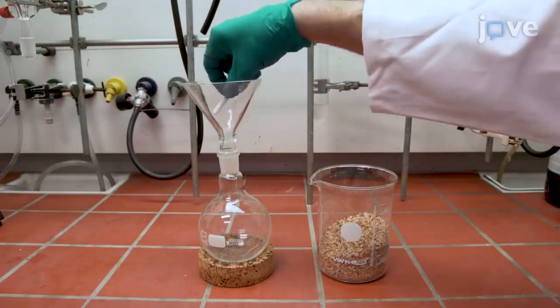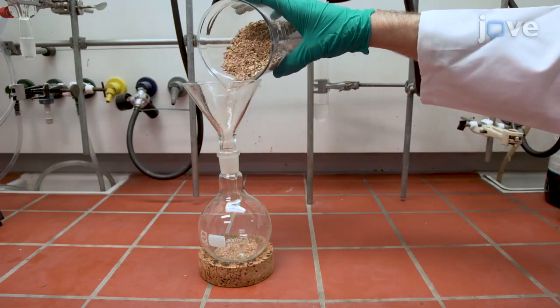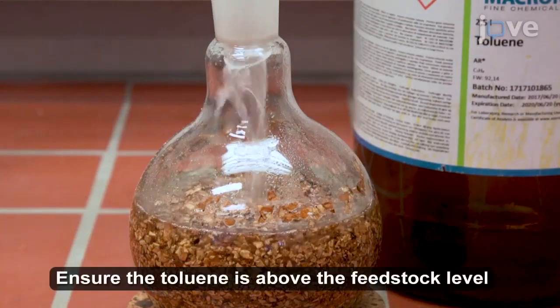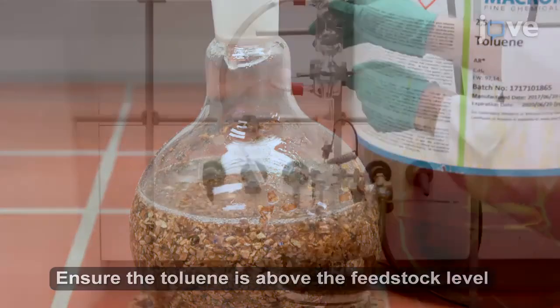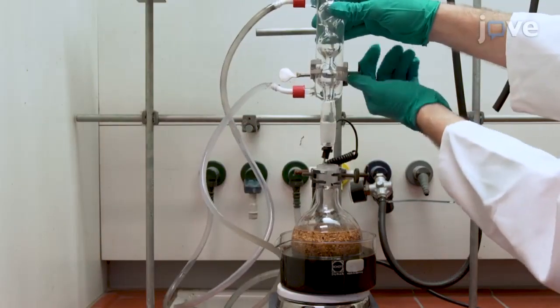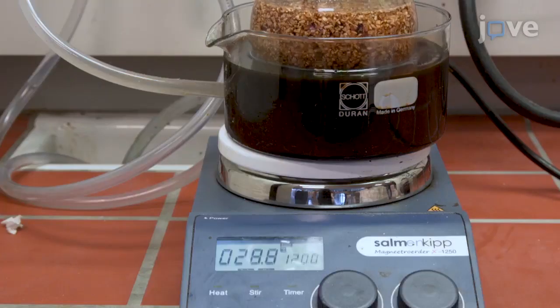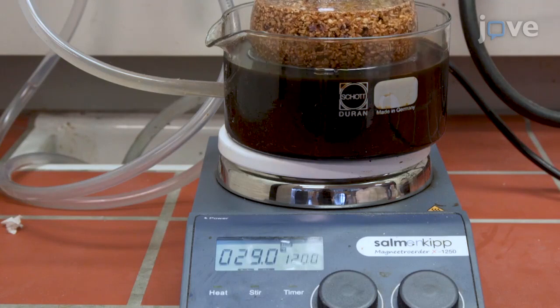To remove extractives from the ground walnut shells, add 150g of the shell sample into a 500ml round bottom flask containing a stir bar and add 200ml of toluene to the flask. Attach a reflux condenser to the flask and heat the mixture to a reflux temperature of 111 degrees Celsius in an oil bath with vigorous stirring.